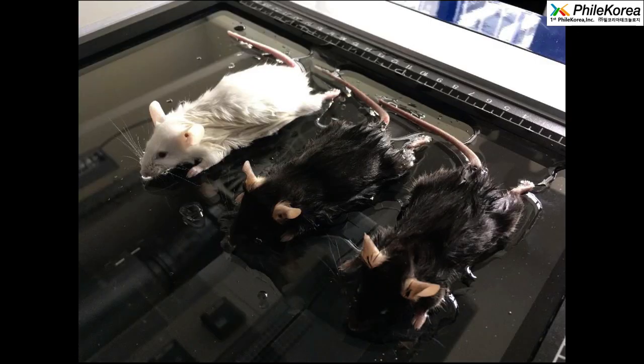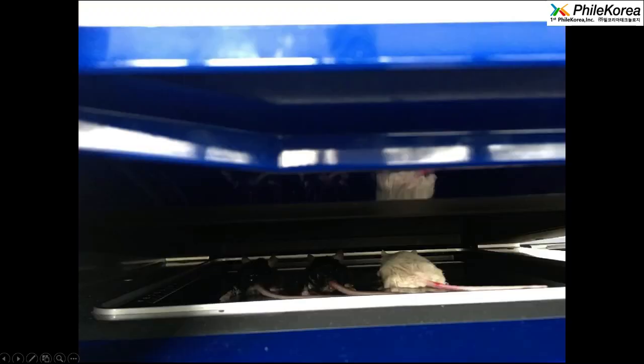So we put the mouse on the scanner. Also here they are lying on this water drop. I use this water drop effect, as I told you before, and I close the lid. And no worry here, we have enough space, around 3 cm. So when we close the lid, the animals are not harmed. In this case, we are talking about post-mortem animals, so they were dead already.